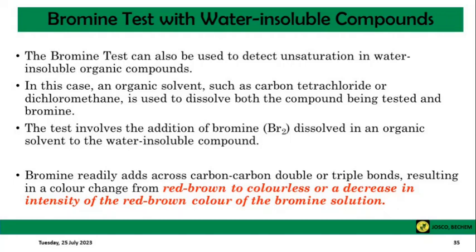Now let's look at the second bromine test, with water insoluble compounds. Just like the name suggests, such a compound wouldn't be able to be dissolved in water. The question then is, what do we need to do to such a compound? Your guess is right.